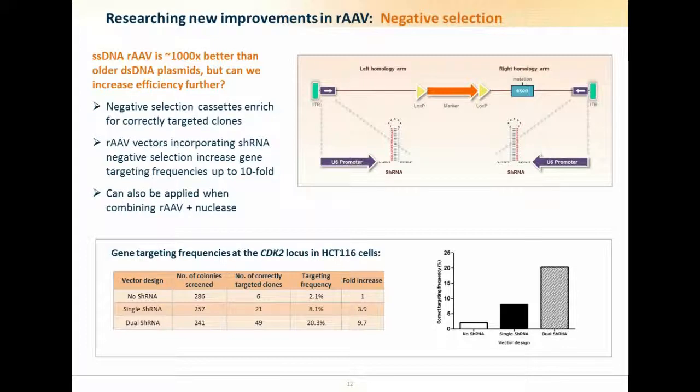So what we've done is to use shRNAs targeting endogenous genes, or in fact the marker gene that's introduced via the virus itself, way out on the ends near the ITRs. When the whole vector itself incorporates into the genome somewhere, these shRNAs get expressed. In the example you see here, these shRNAs would target that marker gene, which could be something like neomycin or hygromycin. And when you do a selection, because these shRNAs have shut down that marker, these randomly integrated copies of the vector will not protect it, and so you can select against those.